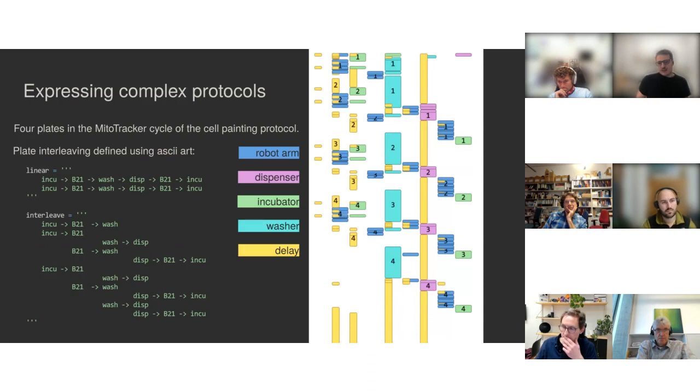But you can express this and solve it and schedule tens of plates using this mechanism. And this is just an illustration, with time going downwards, of how it looks when you schedule 4 plates.